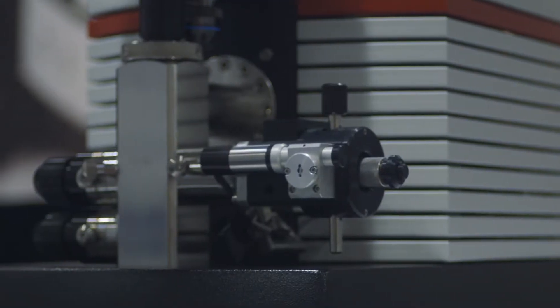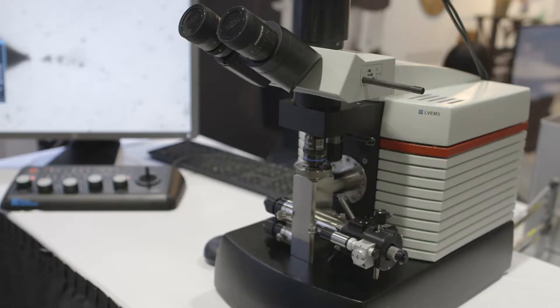The LVEM5 is our first microscope built on the LVEM platform. This is our most versatile, compact and economical instrument, and is designed to be operated in the TEM, STEM and SEM modes at 5 kV.